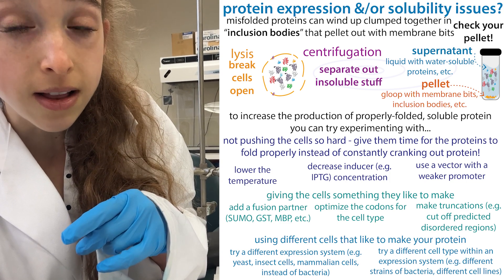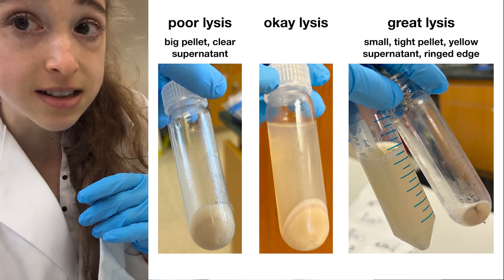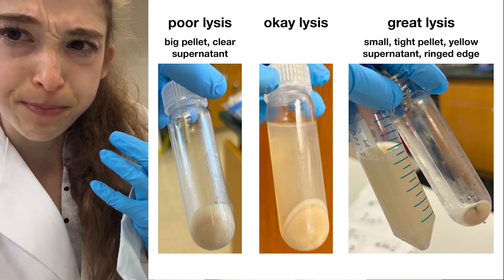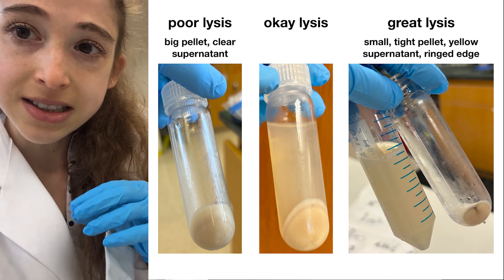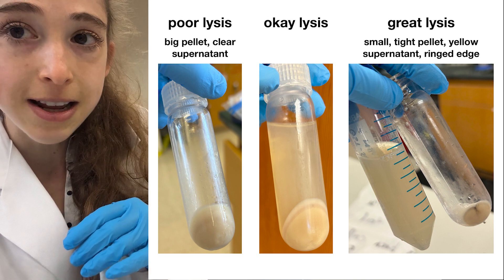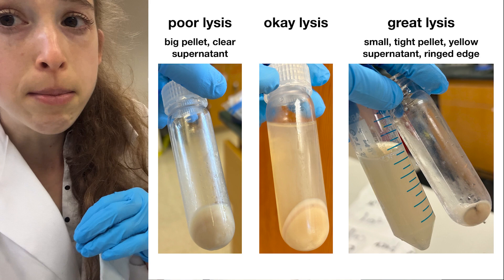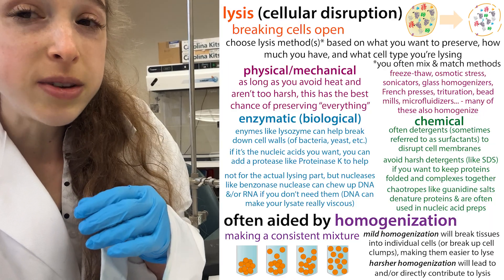If the protein is insoluble, it's going to end up with all those membrane bits. But if your pellet actually has unlysed cells, your protein will be in there too. The way you'd know the difference is by looking at the pellet: do you see that nice tight pellet with rings and a yellow solution, or a bigger, fatter pellet? The pellet should be a lot smaller than when you first spun down the cells — the better the lysis, the smaller and tighter the pellet.